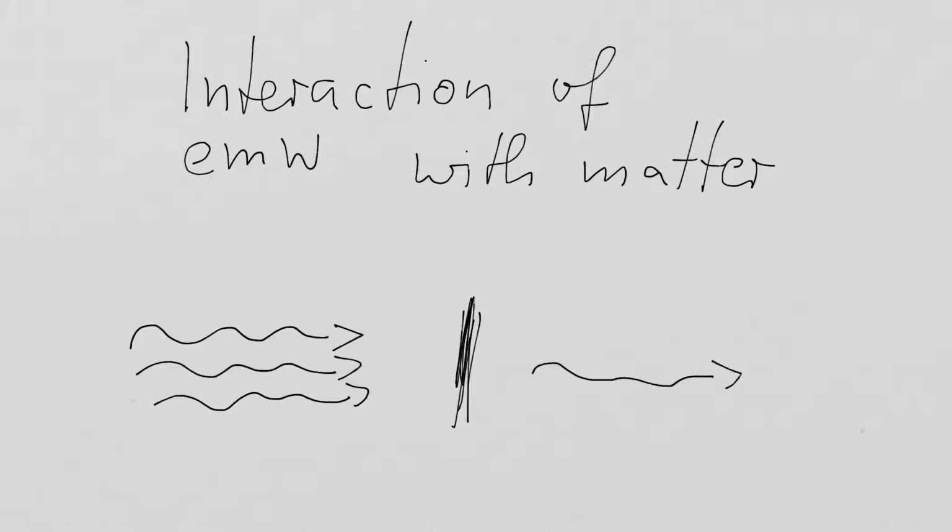Or, in other words, some of the electromagnetic wave is absorbed. Why would we absorb electromagnetic waves?